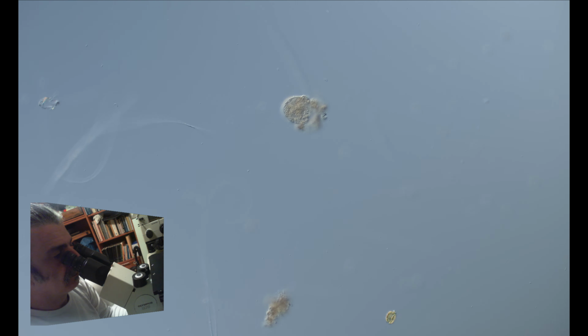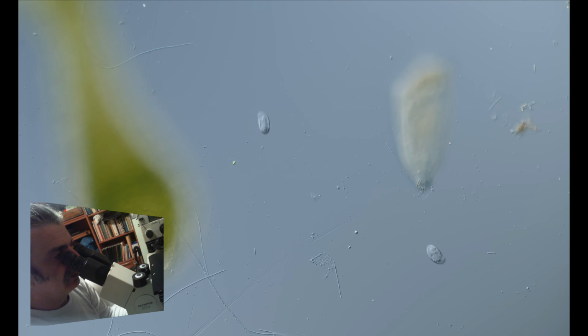Here is another rotifer. Here is another stentor beside the hydra, and pseudophorid ciliates around it.